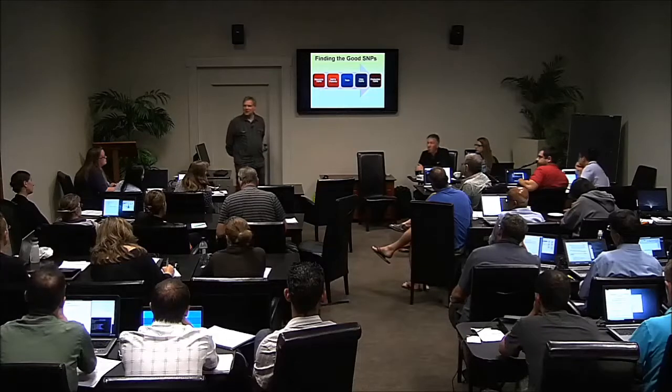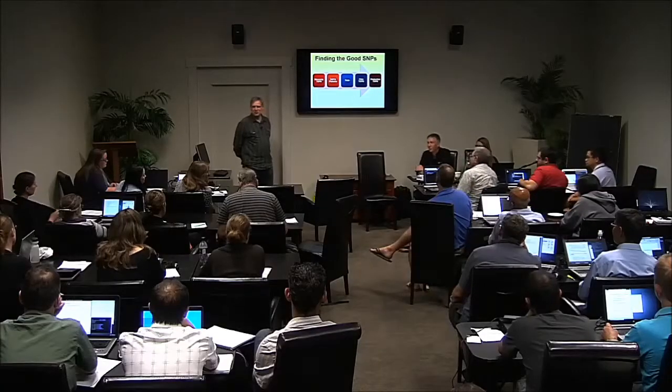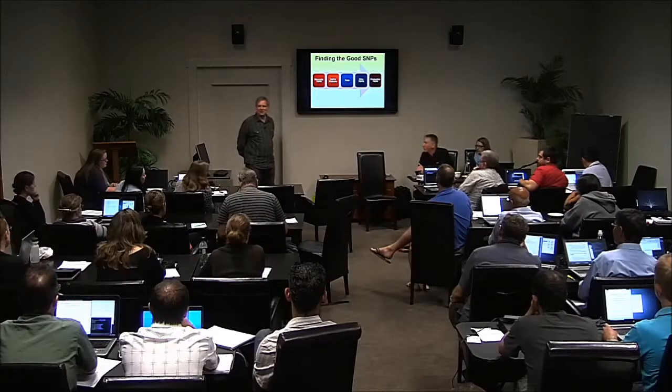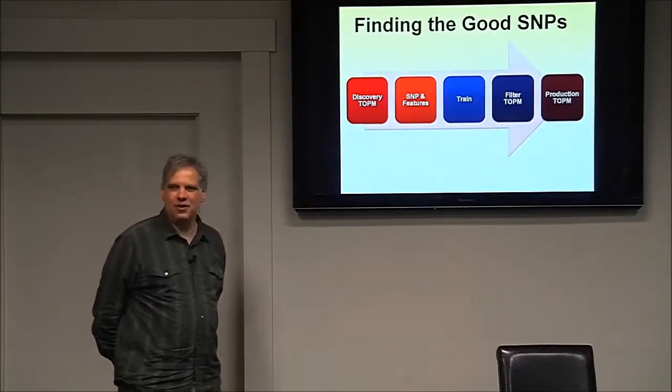Yes, that's a great idea. We should do that. I would say there's probably one caveat. There are all kinds of SNPs in the literature that may not have anything to do with the GBS tag, and if that's the case, putting that information in the TOPM is absolutely pointless. I guess we'd have to know their position in their current genome coordinates, which is not impossible. Yeah, I think that's a great idea.